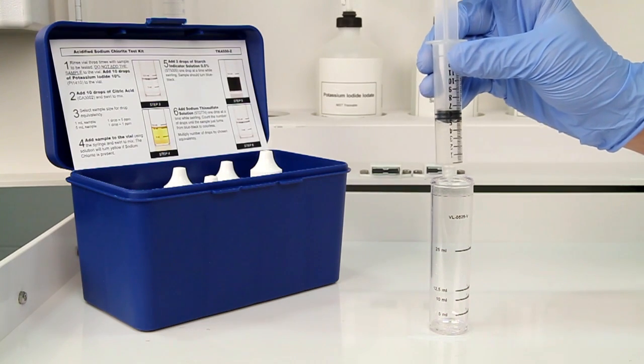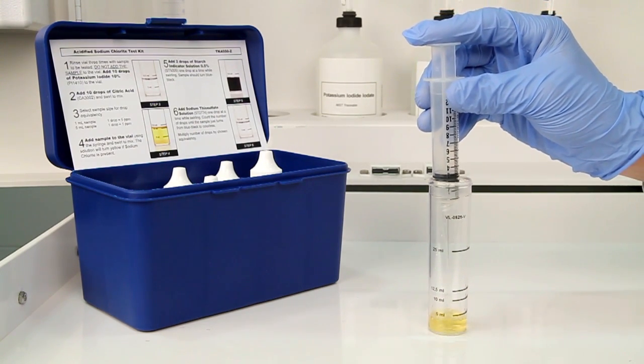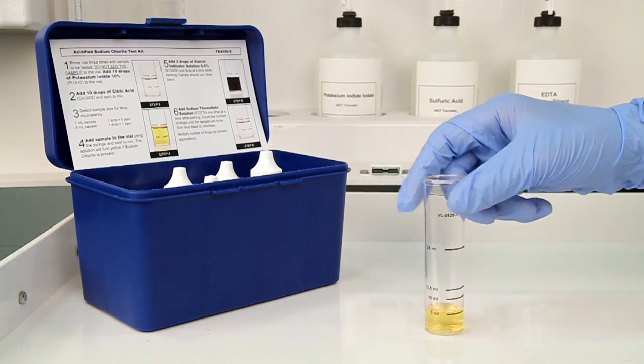Use the syringe to accurately measure your sample and then add the sample to the vial. The sample will turn yellow if sodium chlorite is present. Swirl the vial to mix.